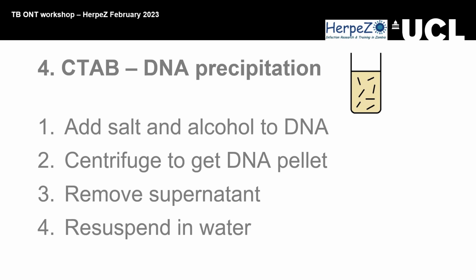Then that's the washing step, using ethanol and isopropanol. When you add isopropanol, it also precipitates the DNA, removing the excess salts and proteins, which we wash off. Isopropanol is used in preference to ethanol, as a lower volume can be used for precipitation.